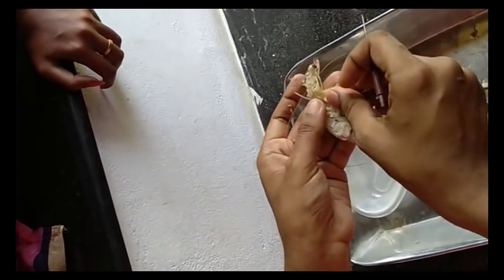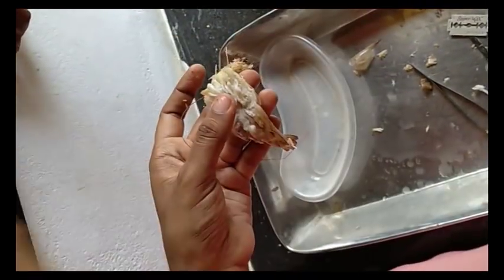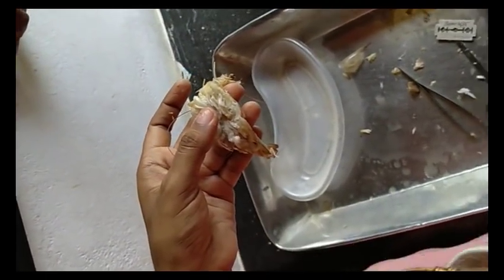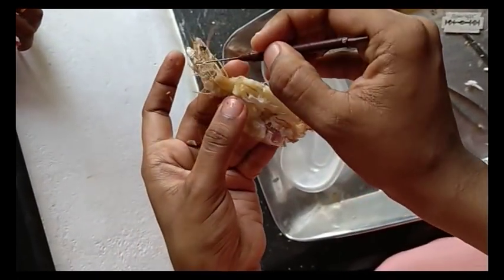And after doing this, you have to display it using bristles or X-ray film. You made some X-ray film pieces to display. You can use that to display the nervous system.